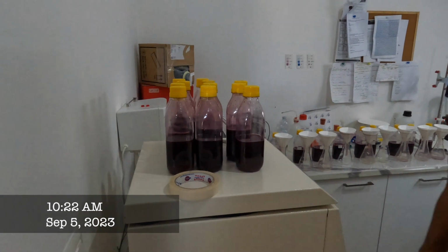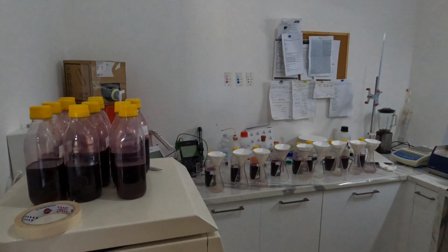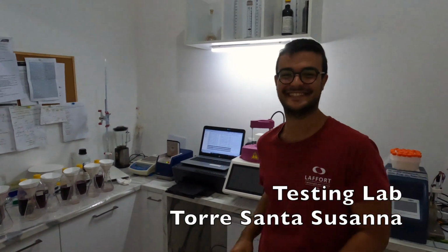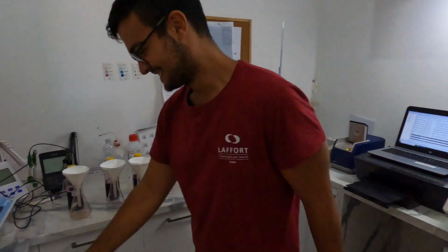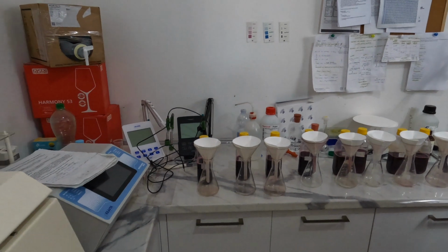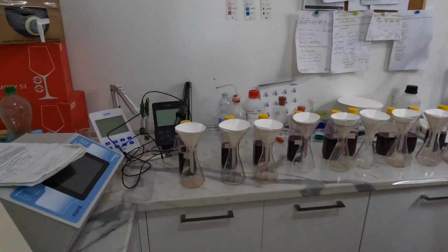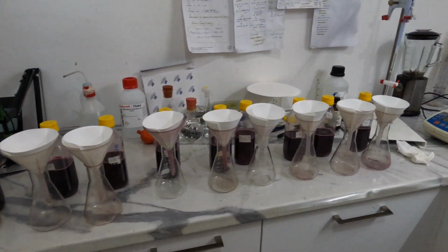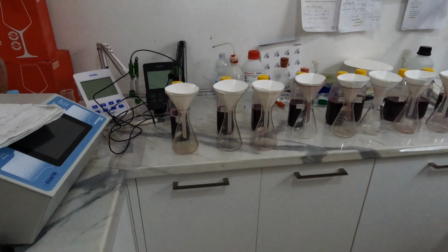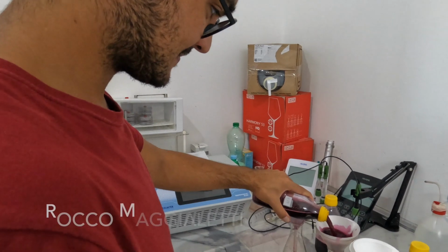Okay, so I'm here with Rocco. He is one of the enologists that works with Teo. There he is. And he's basically doing the testing, the analysis during fermentation. So it's very similar to what we had a couple of days ago, where he's got samples from different timelines since fermentation began. Rocco, what are you doing here now?